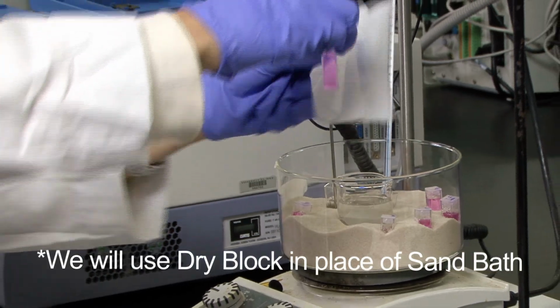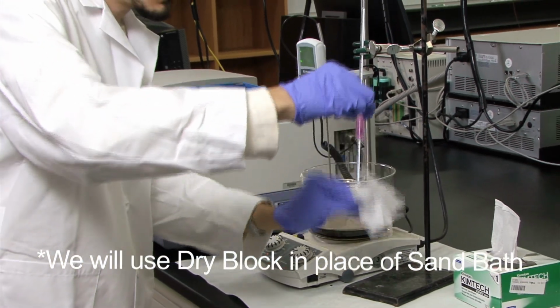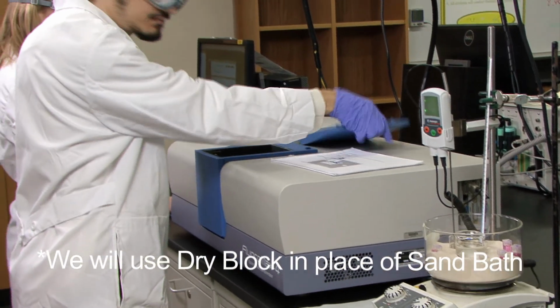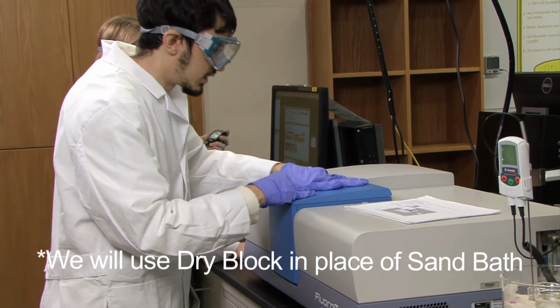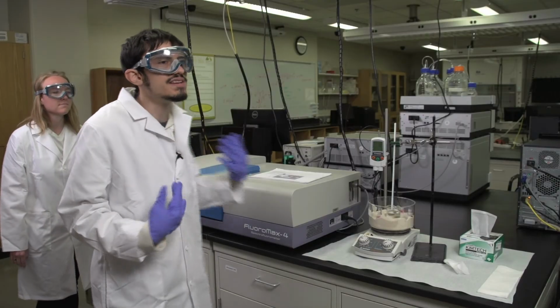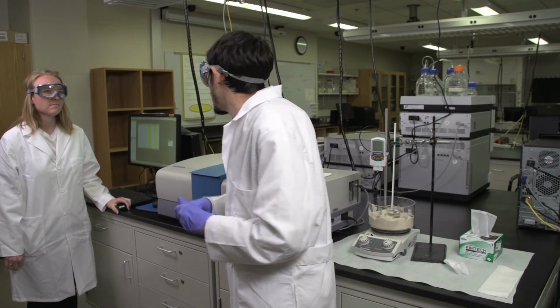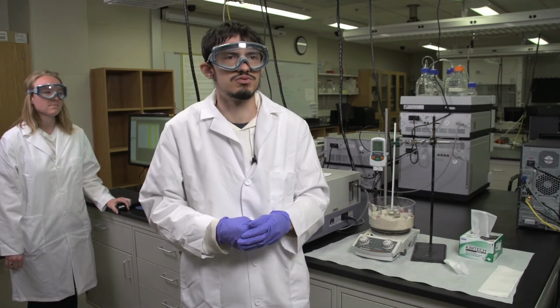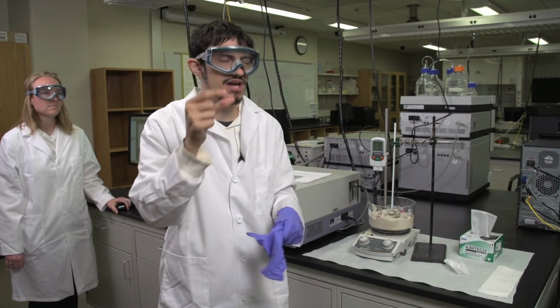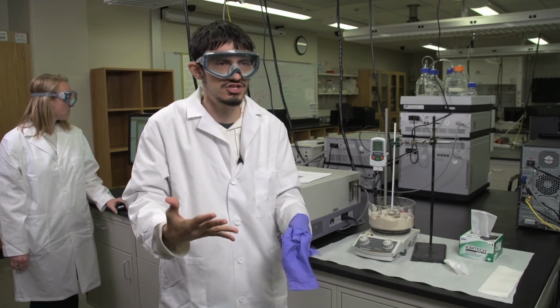Use a Chem wipe to ensure that all water on the outside and sand is off. Place the cuvette into the sample holder, as seen before. Close, and take the spectrum. This again will be a single point spectrum in each of the cases, and you will be able to save these values individually, and it will help to directly place those values, copy and paste them into an Excel file so that you can keep track of them as you go along.